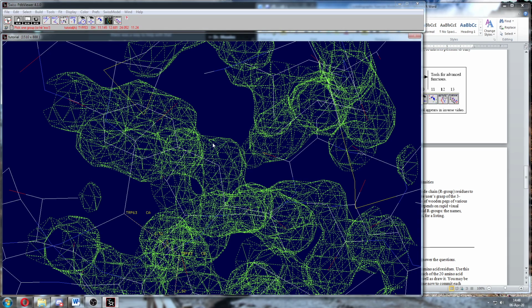After all these years of using this program, this is still the one part, which I don't know why it uses the JavaScript for this part, if it is JavaScript. But it's the one part where it still might crash on you. Right? So when I click on this, it's going to give me some options of what to change the amino acid to. I need to choose it quickly or it generally crashes the program. It's probably a memory leak somewhere. Right? But if I click on this and I said, I think it might be histidine, so I'm going to click this and quickly find histidine. They're in alphabetical order. I don't want to leave it on the screen too long. If you're watching this on the video, pause it and you'll see that box that pops up.